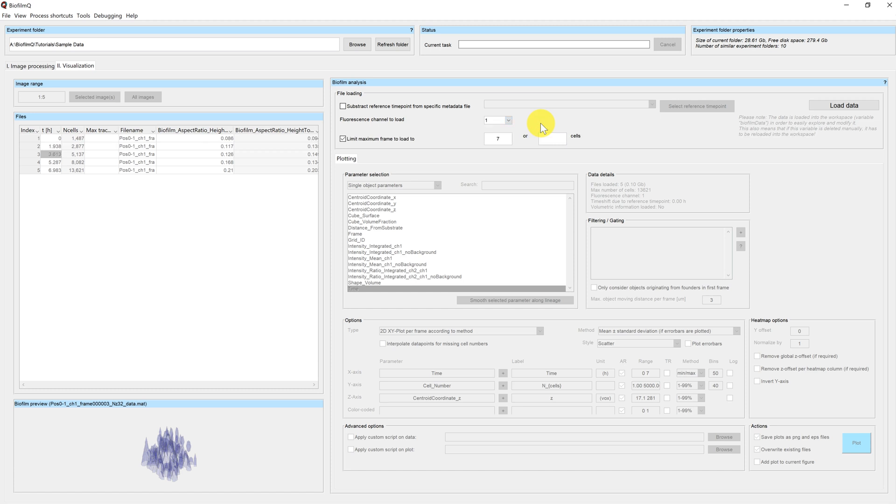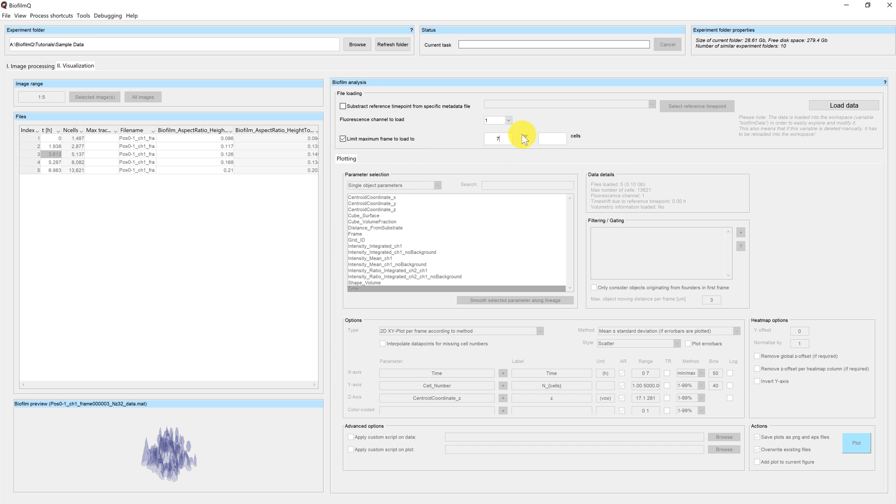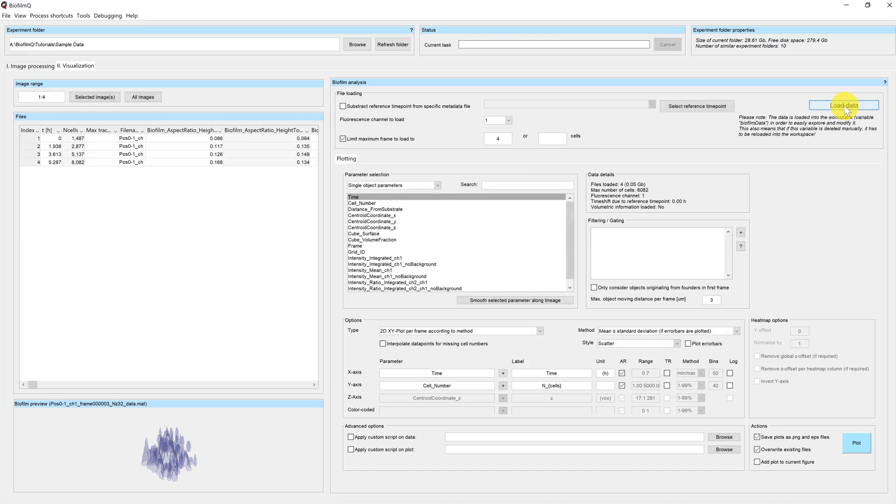So you need segmented files in order to use the visualization. We can also limit our maximum frame to load. Per default it's set to the number of files you have, in this case seven, but you can also choose to load a lower number of files to save time. I will now click on load data and the data is loaded to my workspace. You can see that four files have been loaded, the first four, because I chose to limit the maximum frame.